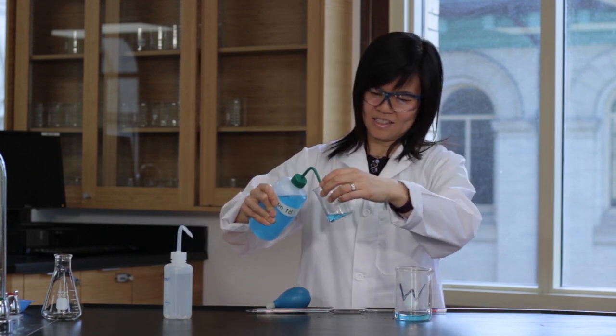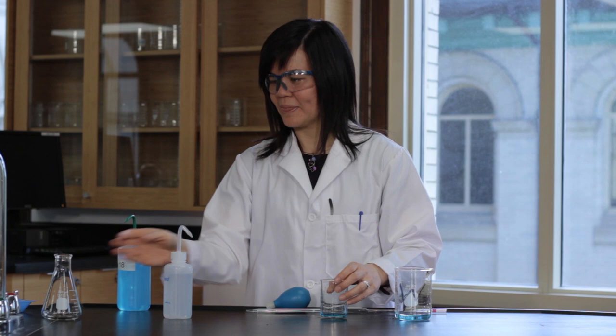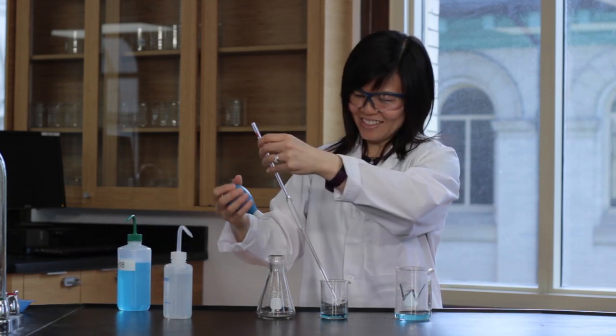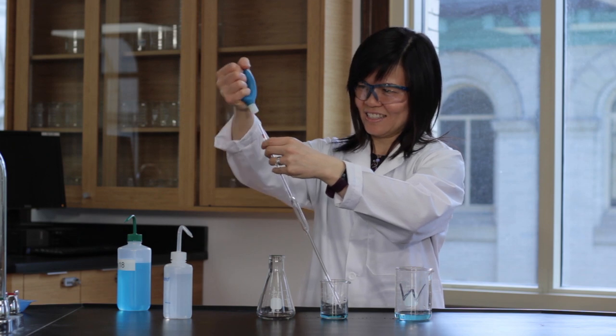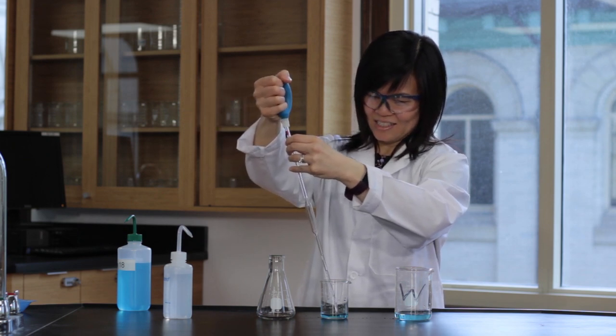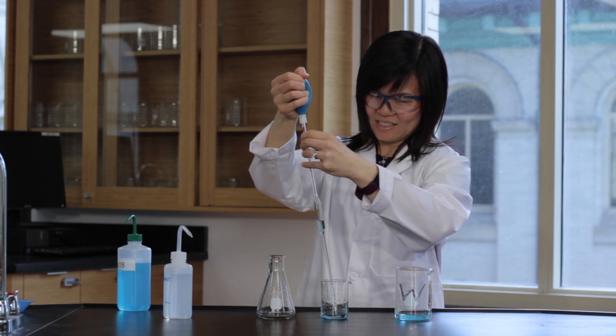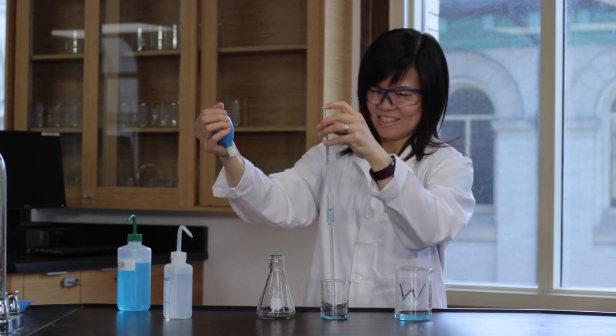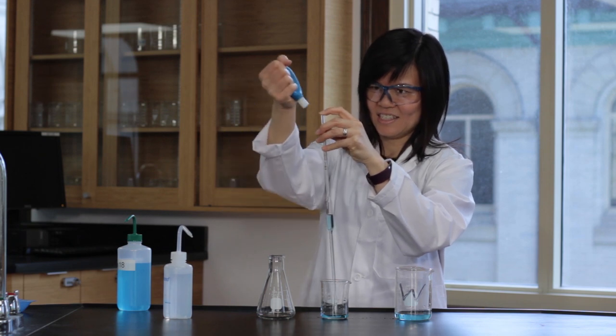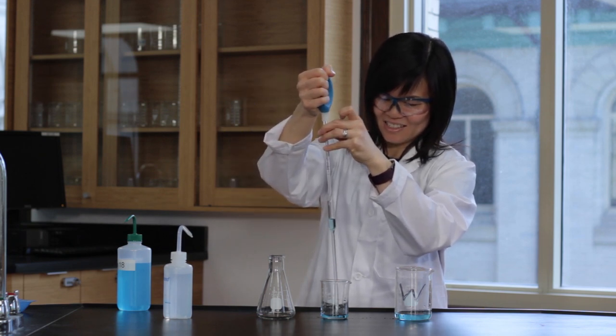Insert the pipette tip into the solution and draw in the solution until the liquid level is a couple of inches above the mark. Remove the bulb and quickly place your forefinger over the end of the pipette to prevent the solution from flowing out.